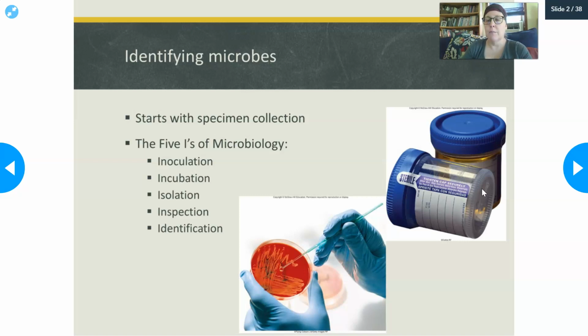So it is very important to not assume that a golden yellow liquid is urine, and to properly identify it. But if it's urine, it's also important to identify things like, was it voided urine, or was it from a catheter.